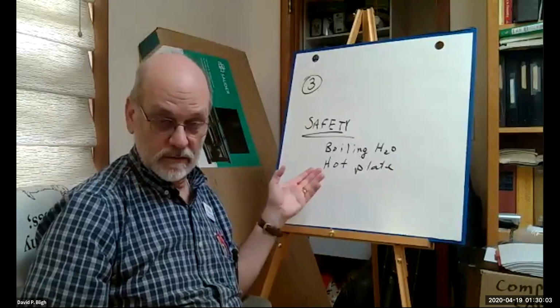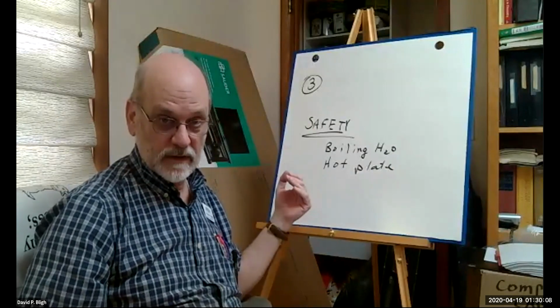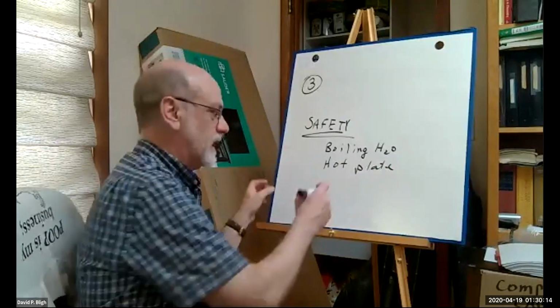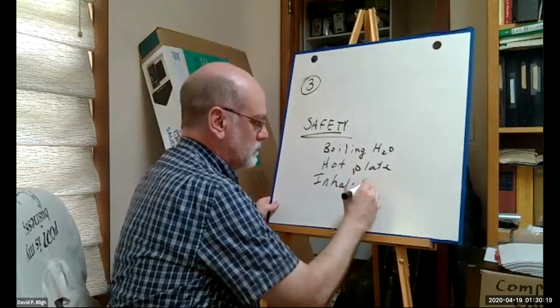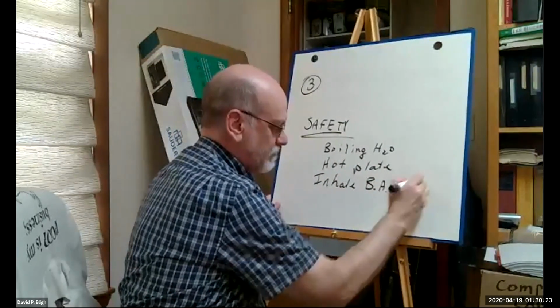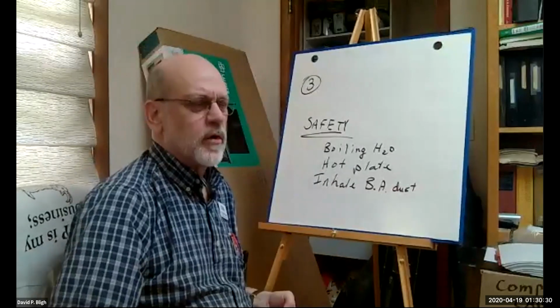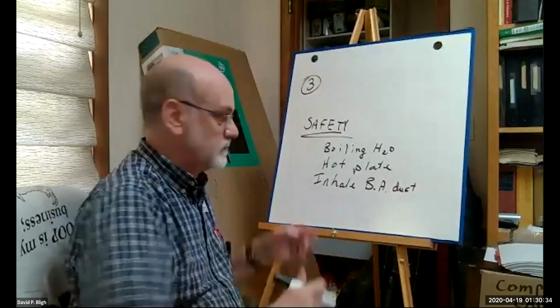The real possibility of injury, particularly with benzoic acid, is if you inhale dust particles. Benzoic acid dust could damage your lungs. Let's see, where's some other safety? Oh, we're using glassware, aren't we?